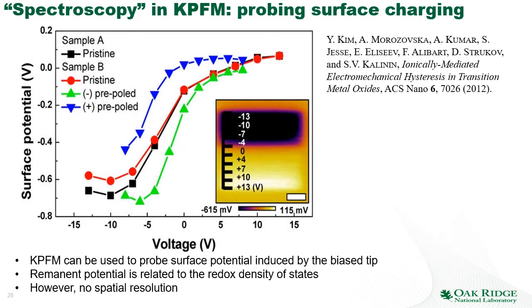Obviously, this measurement is a little bit difficult for the very simple reason that once I induce the potential on the surface, the potential on the surface is no longer the same. So I cannot really compare the response of the same part of the surface. However, I can run a very simple model of these measurements when I assume that for some specific material, the surface properties are uniform. And then rather than measuring one region many times, I can measure multiple regions one time.